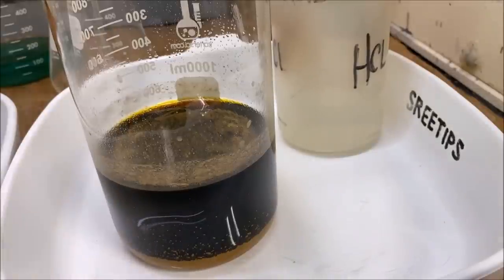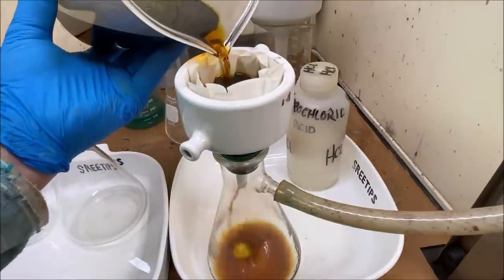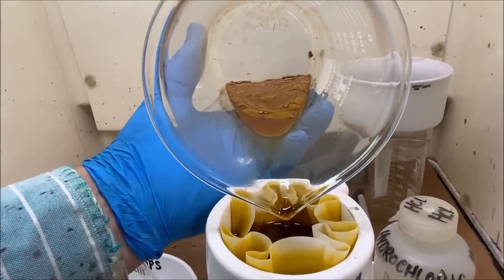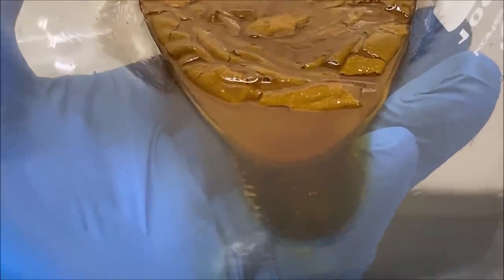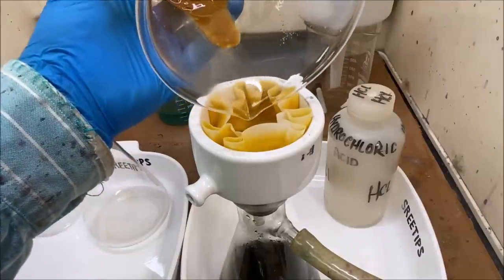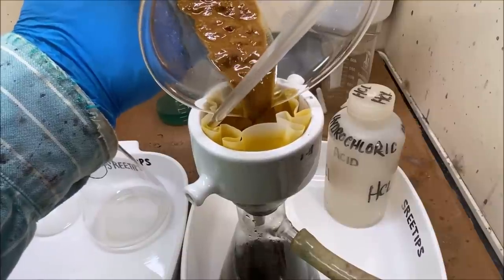Looks like we've got the gold to settle out here. What we'll do is, I've got a filter prepared. Here's what we've got down in the bottom of the beaker. Not quite sure what that is. Doesn't have the consistency of gold that I'm normally used to seeing. Now let's just push on here. I guess that might be gold. I'll collect this material in our filter. Might be gold. Quite a bit of it if it is.